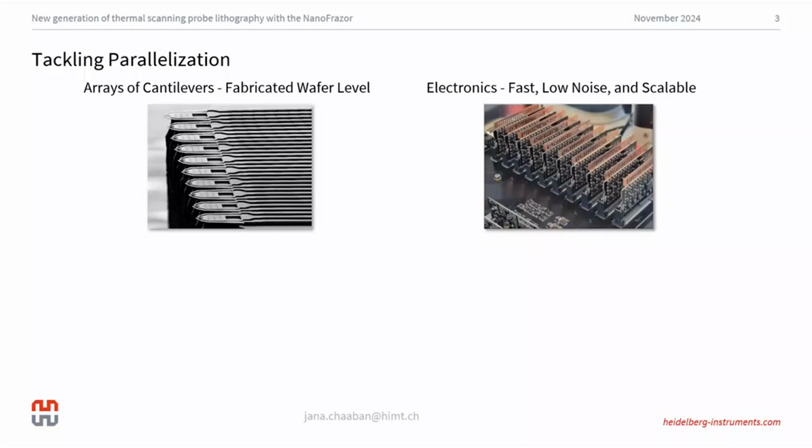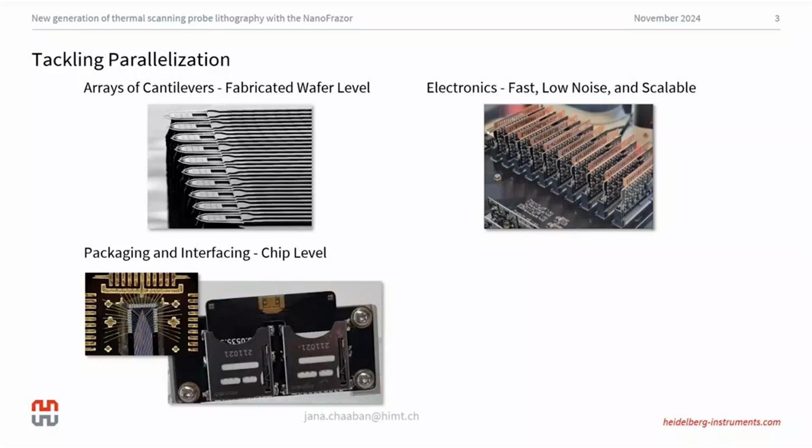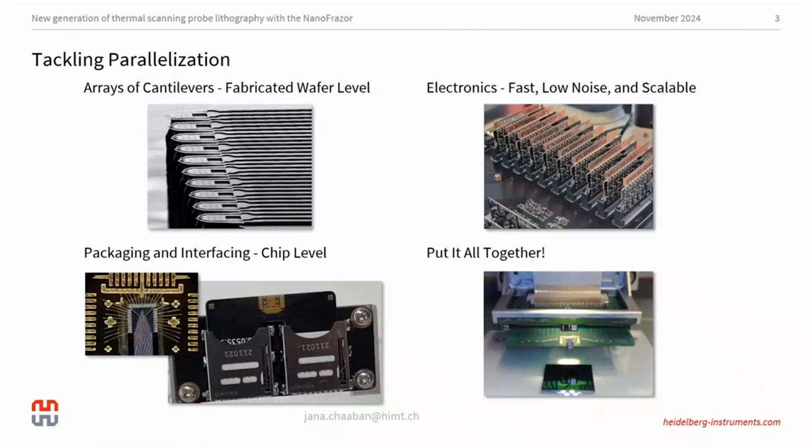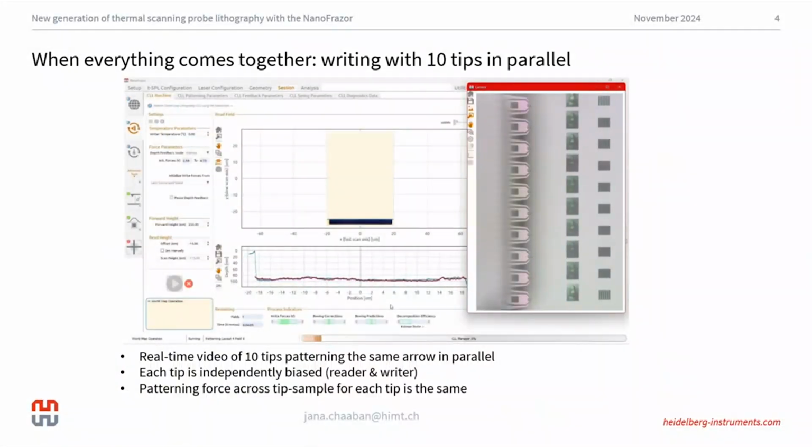At the moment, the decapede comes pre-packaged to a PCB. This makes the loading and unloading of this module much easier on the tools. And instead of using the regular tweezers, we can simply use our hands. I'll show you the first example of the decapede working.